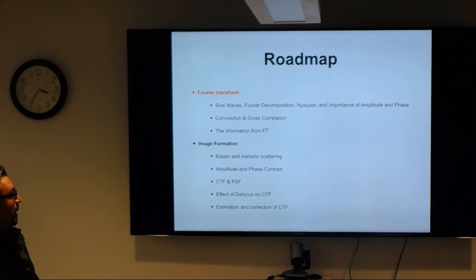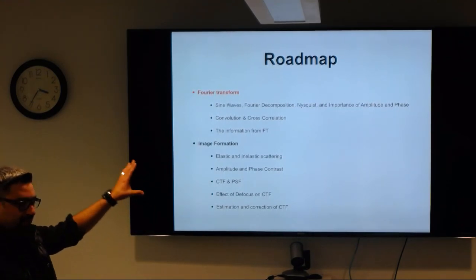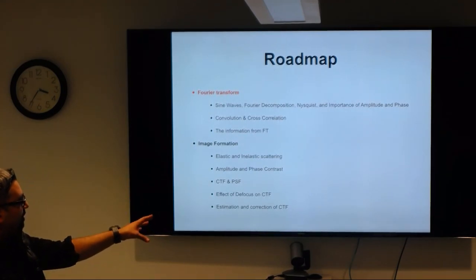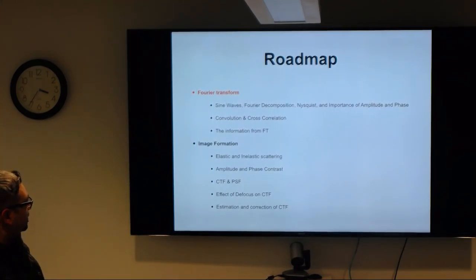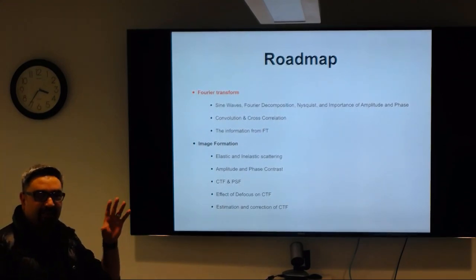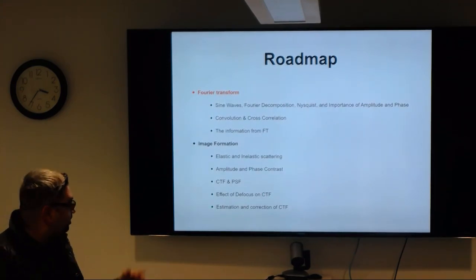I'm going to discuss Fourier Transform as well as image formation. With Fourier Transform, I'm going to talk about sine waves just to briefly introduce them, talk about Fourier decomposition, some Nyquist, the importance of amplitude and phase, convolution, cross-correlation, and what kind of information we could actually get from Fourier Transform.